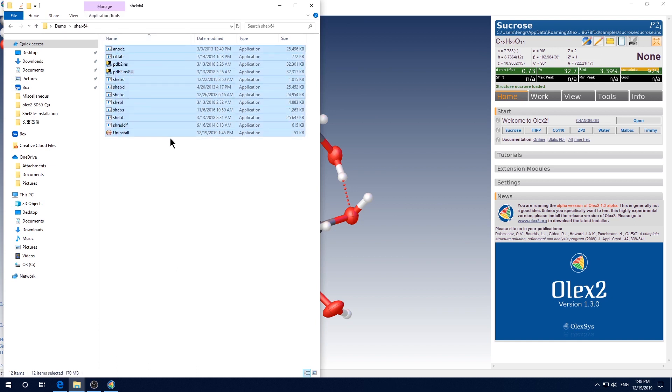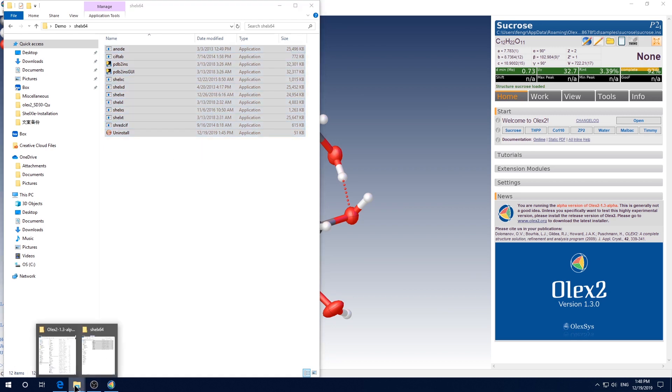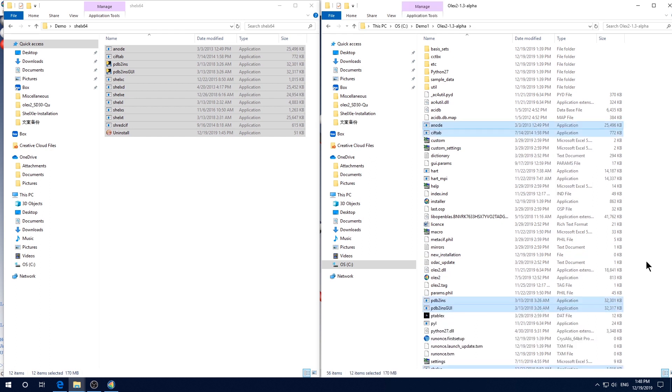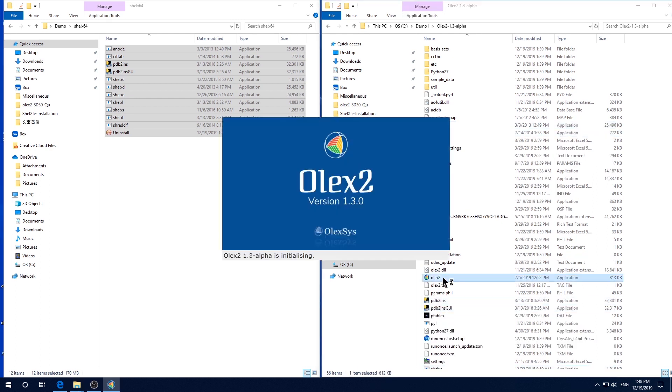Then select all. Ctrl C to copy. Then go to the installation folder of Olex 2. Then Ctrl V to paste. Then restart Olex 2.